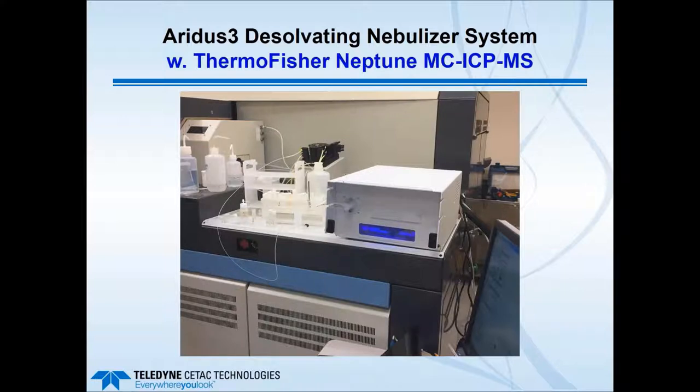Then on the other common multi-collector ICP-MS, that being the Thermo Fisher Neptune, there you see the sampling area near the torch box for the Neptune. Again, in this instance, we were doing manual sampling, and there's also the peristaltic pump just to the left and behind the Aridus3 to remove any liquid that might accumulate in the spray chamber. If you look in the middle of the picture, you can just see the encapsulated carbon fiber support, and we had placed the uptake line in one of the samples in the tube holder rack that's on the sampling area.